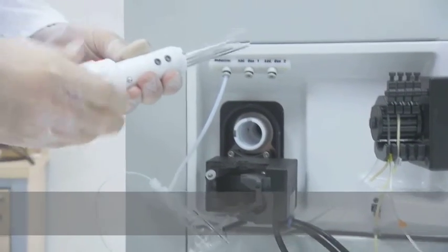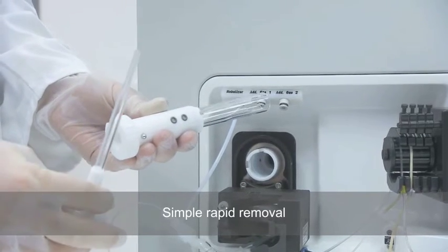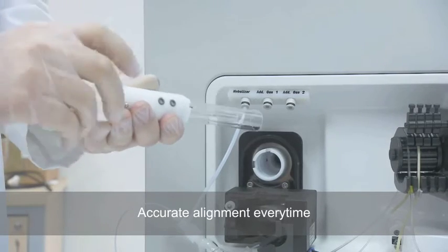A bayonet fitting torch ensures simple, rapid removal for inspection, cleaning, or replacement. The auto-aligning injector guarantees accurate alignment every time.